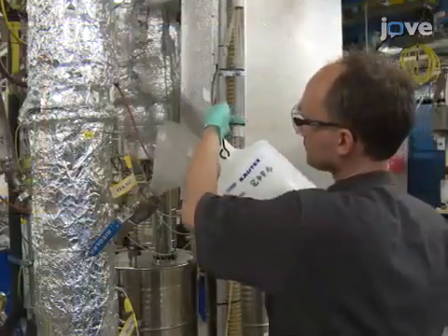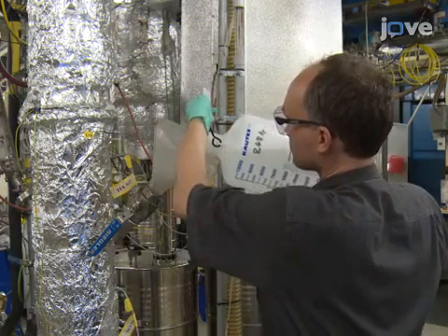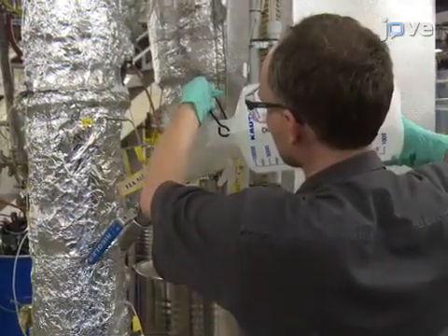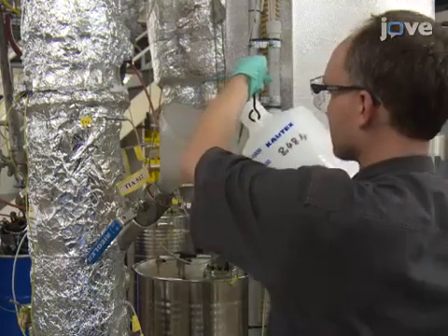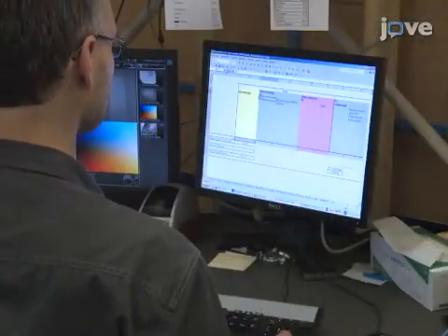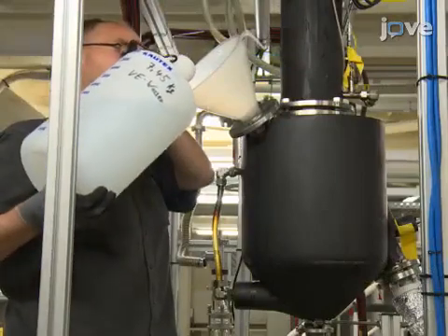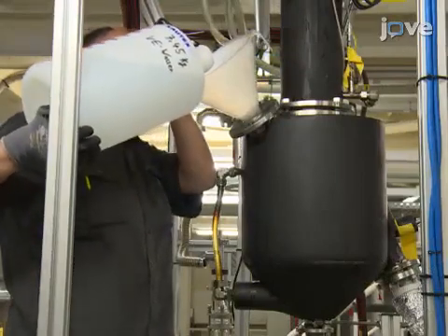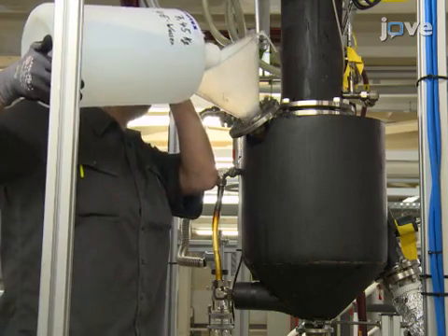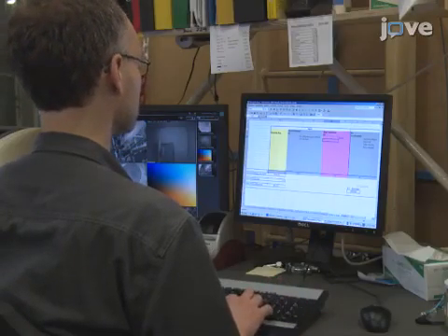Next, fill the bio-oil cycle with an appropriate amount of ethylene glycol as the starting medium for the quenching system to allow safe operation of the pump. Record the weight of this starting medium. Then fill the aqueous condensate cycle with an appropriate amount of water as a starting material to allow safe operation of the pump. Record the weight of this starting material.